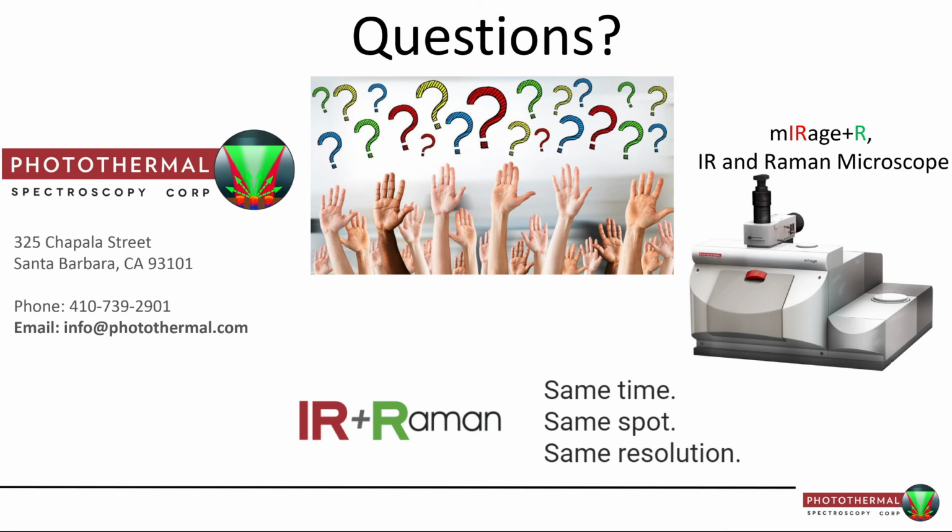Victoria, do you have any comments about Raman versus IR sensitivity in your experience? Well, I agree with you that IR is more sensitive than Raman, and we should say as well that Raman can cause damage to the samples. We have seen that in many types of materials. So for us, it's not just a matter of sensitivity, it's also that Raman can damage the samples, and having samples from cultural heritage, the possible damage of the sample is a big deal.